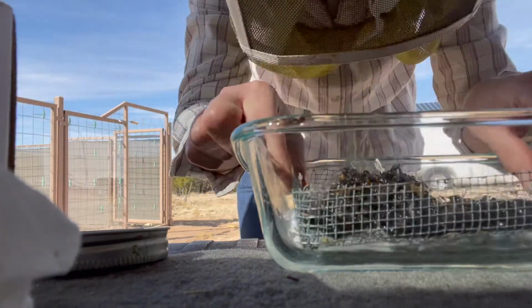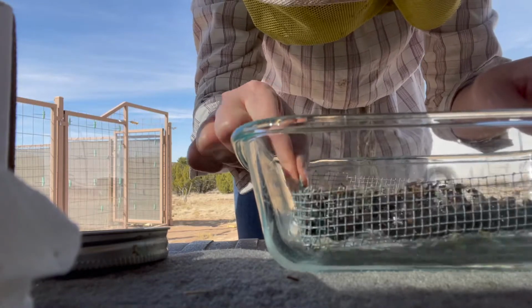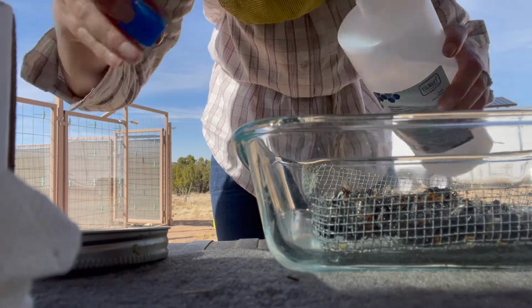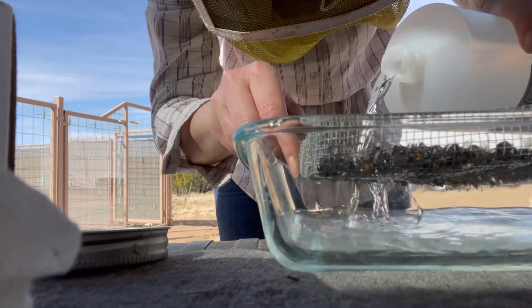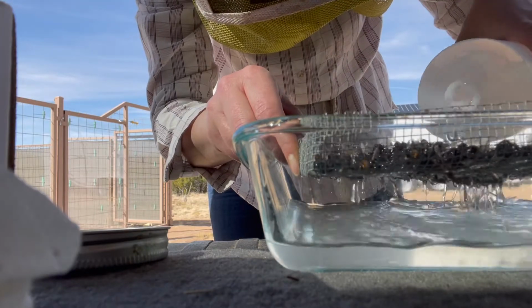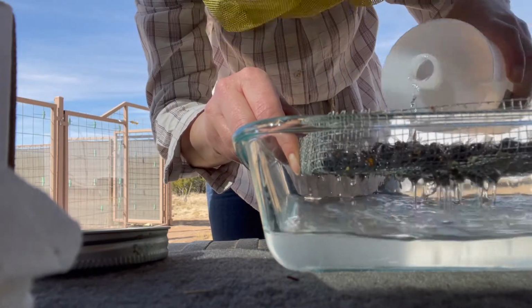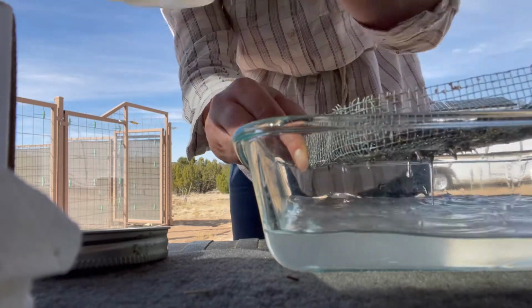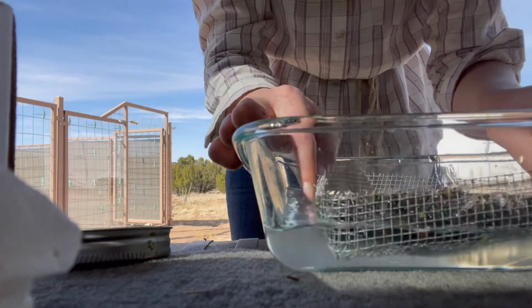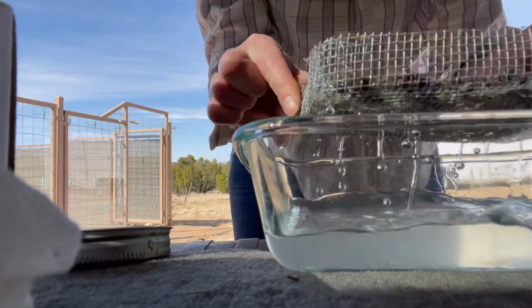And so you can see I pour them out of the jar and into that little tray I made with the hardware cloth, and kind of shake them around in the alcohol, rinse them more with alcohol on top to get any mites off. Yeah, and so I kind of dip it back in the alcohol. I think I do that in this video. There we go. And wash them back and forth.